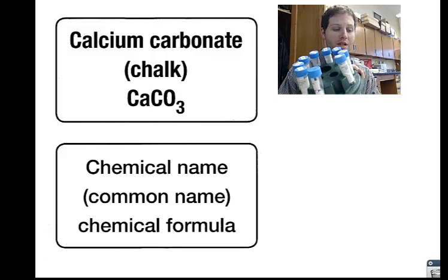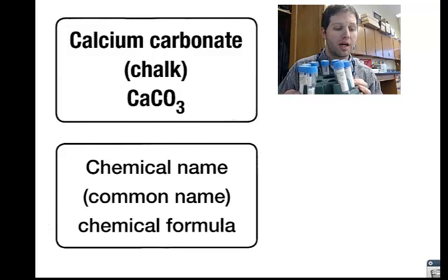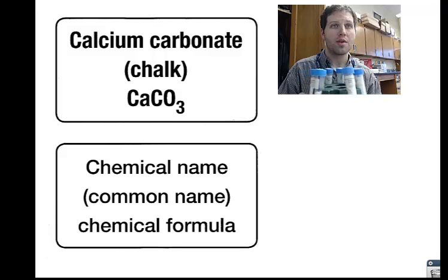Each group today will have a set of white substances just like this to work with. Your first task will be to observe the 9 substances to become familiar with their names and properties.